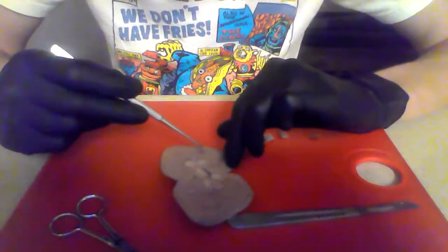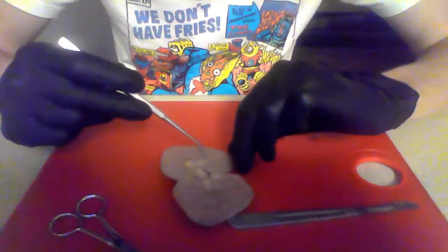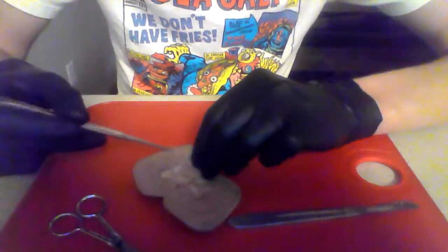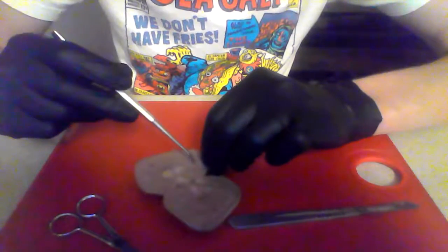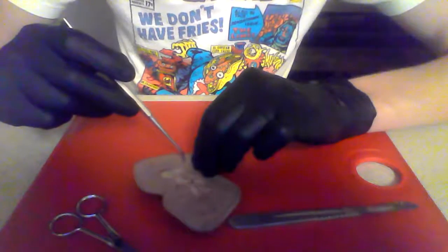They are relatively difficult to see on my kidney, but we can point out where they are for sure. What is the giveaway is the base here, right here, right here, right here, all the way around. So that is the base of the renal pyramid.